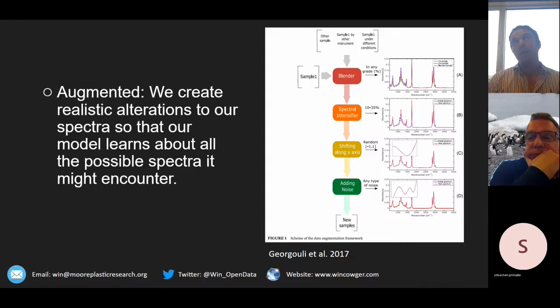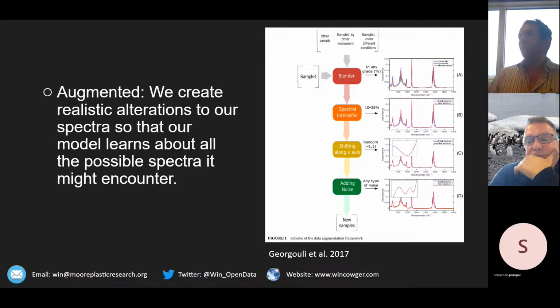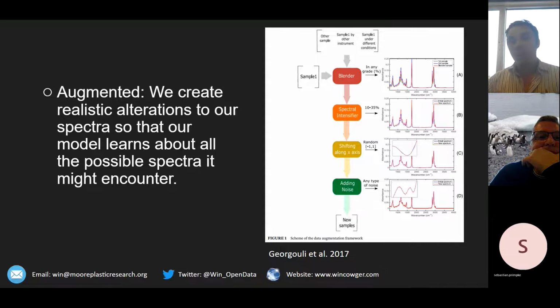One of the things that I am currently trying to figure out, and maybe this is a question to everybody, is which mixtures are appropriate. Because one thing I think about is, should we just be mixing everything? Is there such a thing as a polypropylene cellulose mixture? Does that make sense? Should we have that in our library, or is that going to confuse people? Huh? What's that? Biofilm. Oh yeah. No, yeah, true.